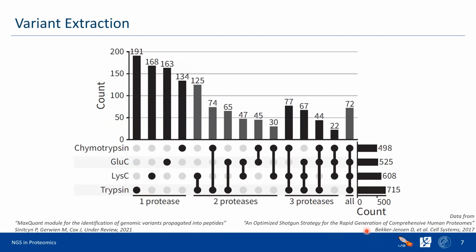First of all, we used very generous fractionation. Each sample was fractionated into, I remember, 39 fractions. And on top of that, we used different proteases. So imagine we're taking, let's say, the HeLa cell line. We are digesting with chymotrypsin, GluC, LysC, trypsin, and this all happens in parallel, not in one tube, of course. And each of these samples we're fractionating into 39 fractions.